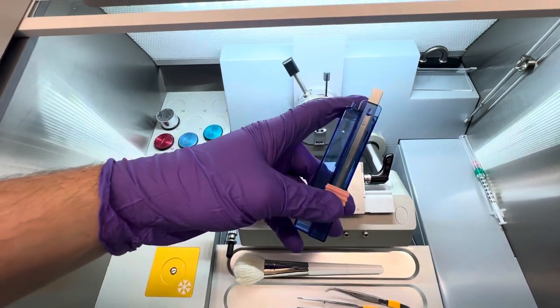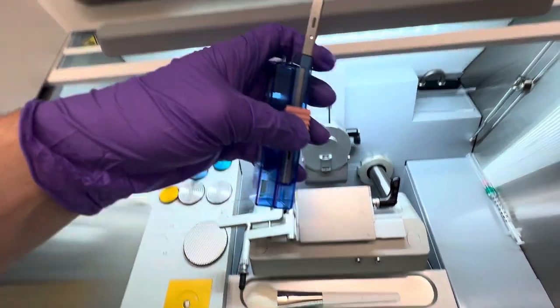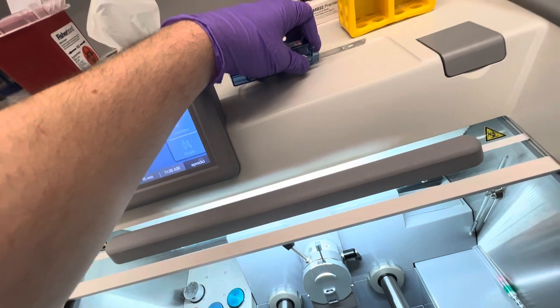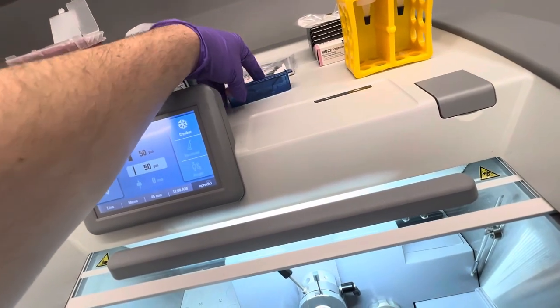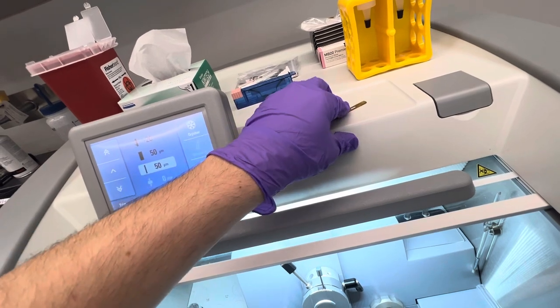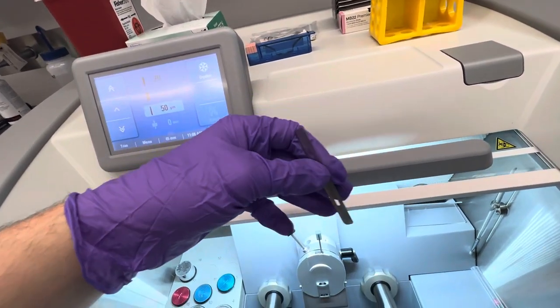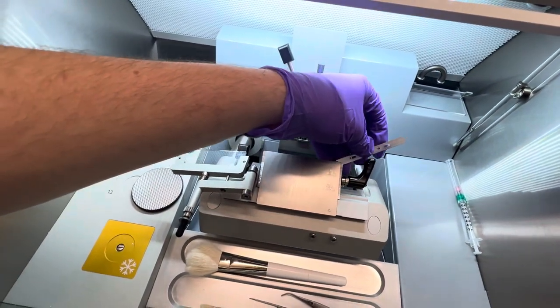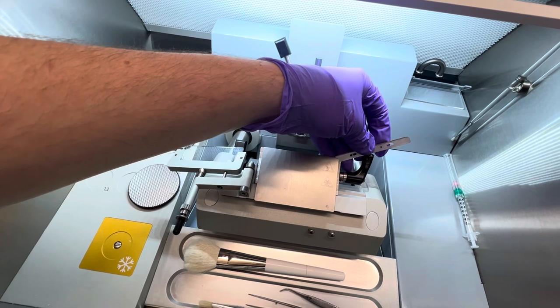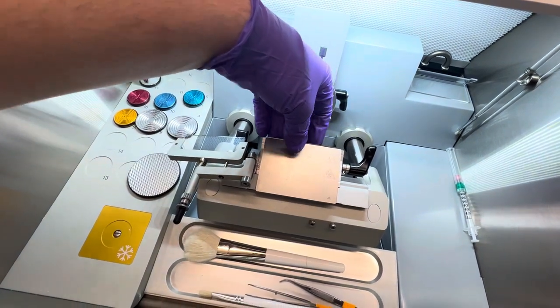Okay, so nice and careful, slide it out. I don't advise doing this with one hand like I am. Be very careful when doing this because these blades are very sharp. I'm going very slowly. So how you would do this is, I already unclamped it before. It slots into here. This is really tricky, but be very careful. Slots in here like so.